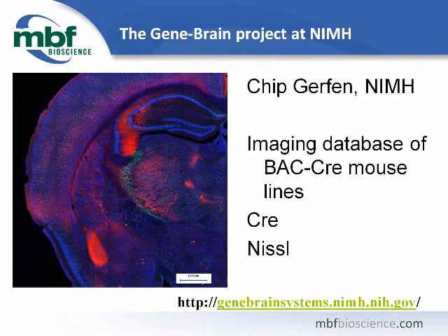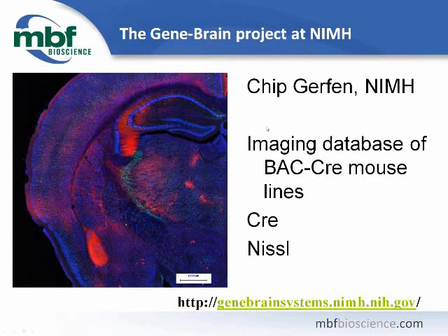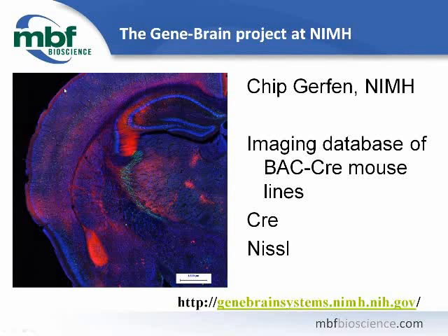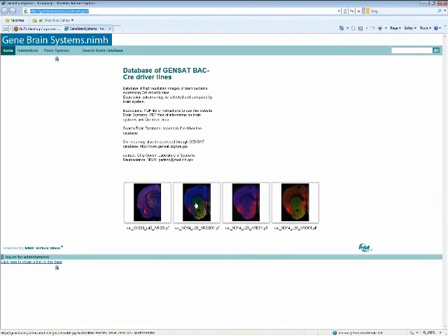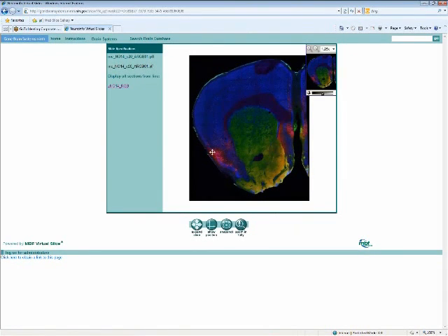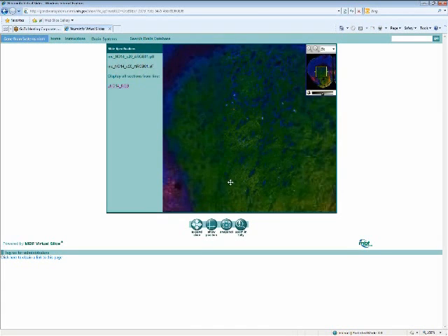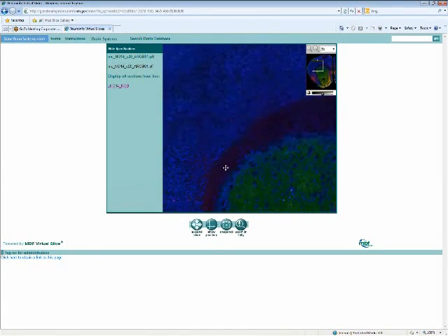I want to highlight one other way to use images created in Stereo Investigator or Neuralucida. The Gene Brain Project, headed up by Chip Gerfen at the NIMH, is an imaging database of Cre recombinant mouse lines. These are virtual tissue images of entire hemisections of mice, created into a maximum intensity projection and published on his website. You can see the difference in different recombinant lines very easily — a picture is worth a thousand words. You can zoom in on his website and look at expression patterns in the different mouse lines.